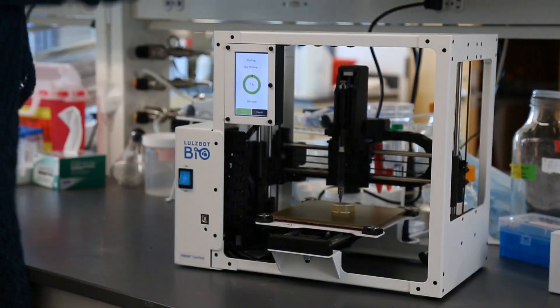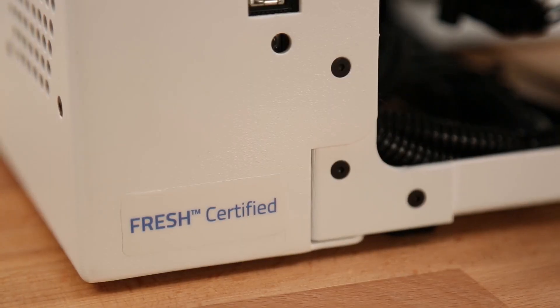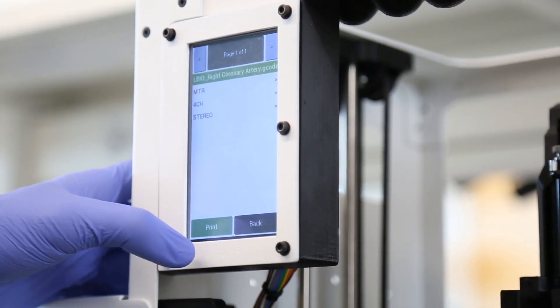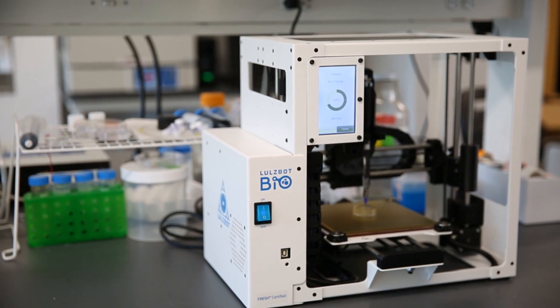Being fresh certified means that whenever anyone tries to start doing fresh printing, this is a trusted source from hardware, firmware, software. Everything in this ecosystem has been certified ahead of time to try and guarantee your success with fresh printing.